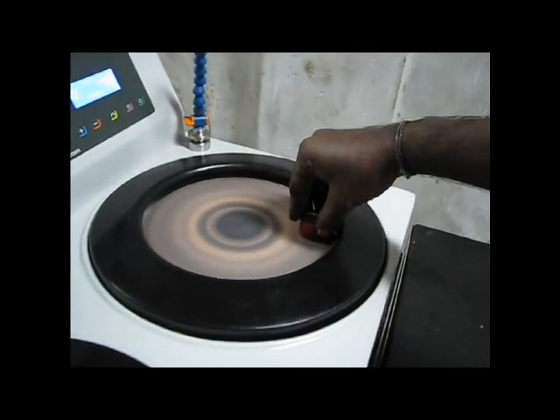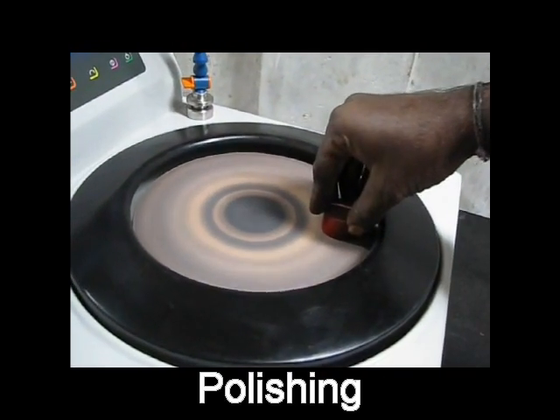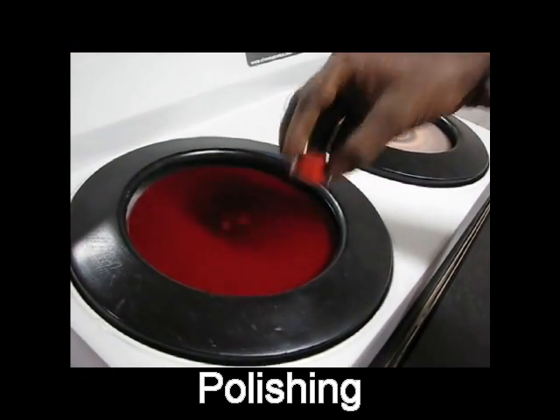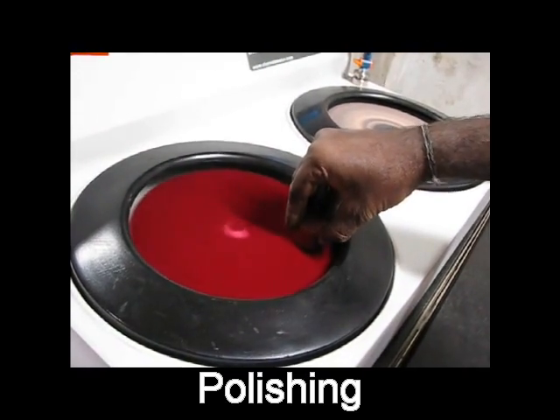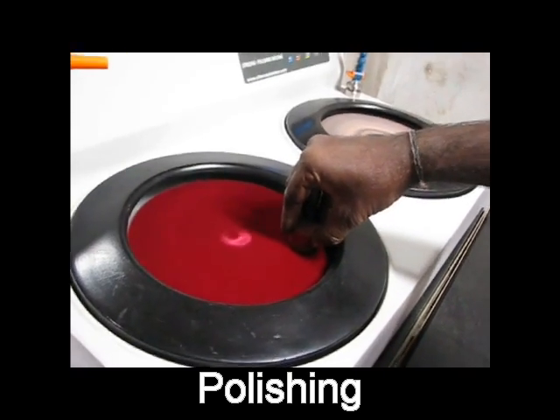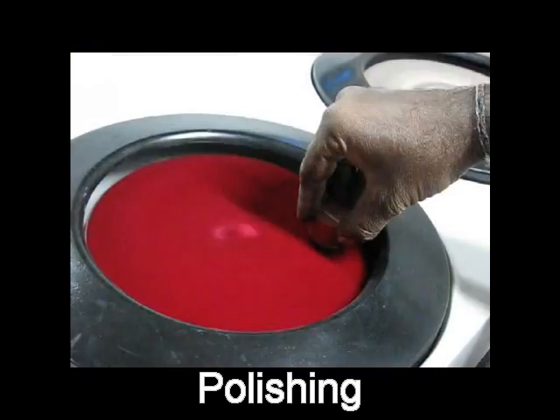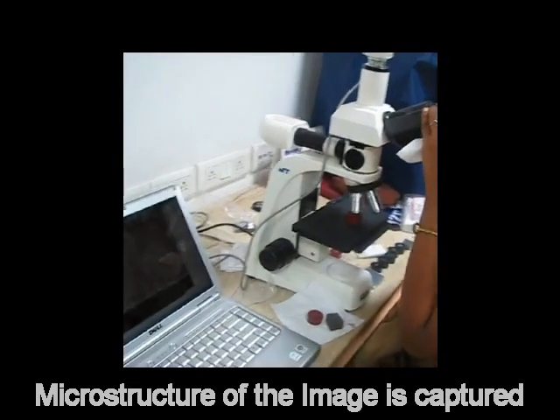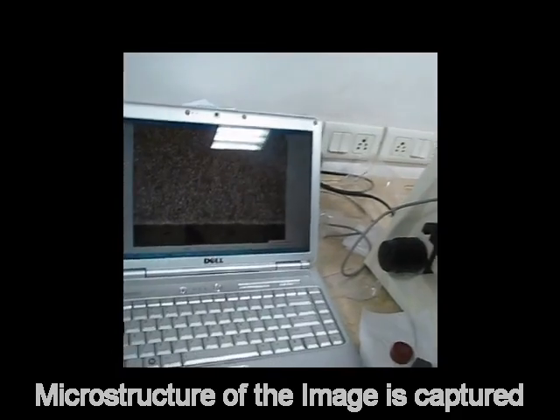After the sample is done with molding, we need to polish the molded sample to get a fine microstructure. We can see the polished sample, which is done with both emery sheet and polishing cloth.